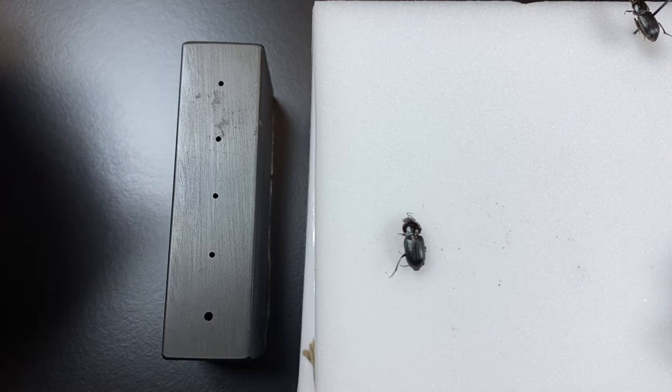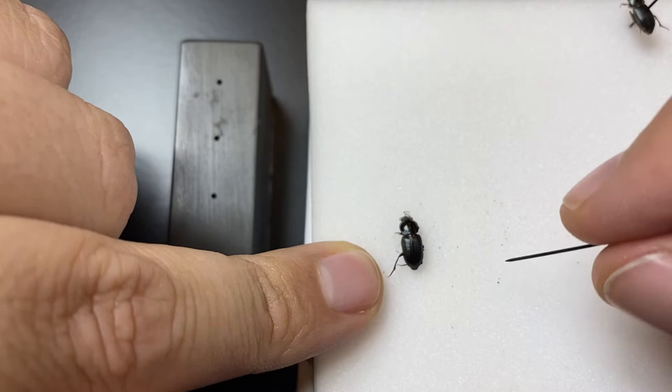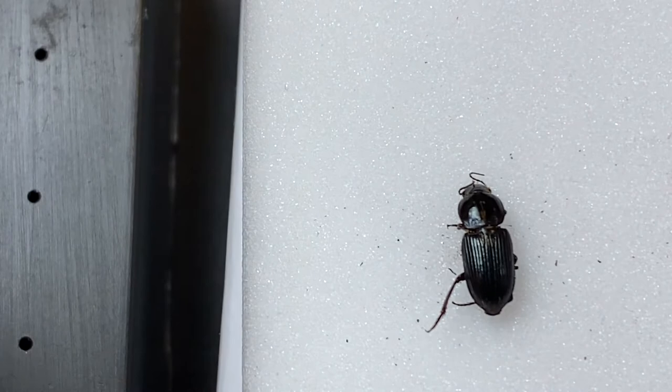In this video we want to look at pinning beetles for the NEON Biorepository. Here I have one specimen, this beetle, which is on a styrofoam background. This styrofoam is what we call plastizote. It's relatively firm. I oftentimes like a firmer background, but something where the beetle can rest on it and it's not going to sink in too far.